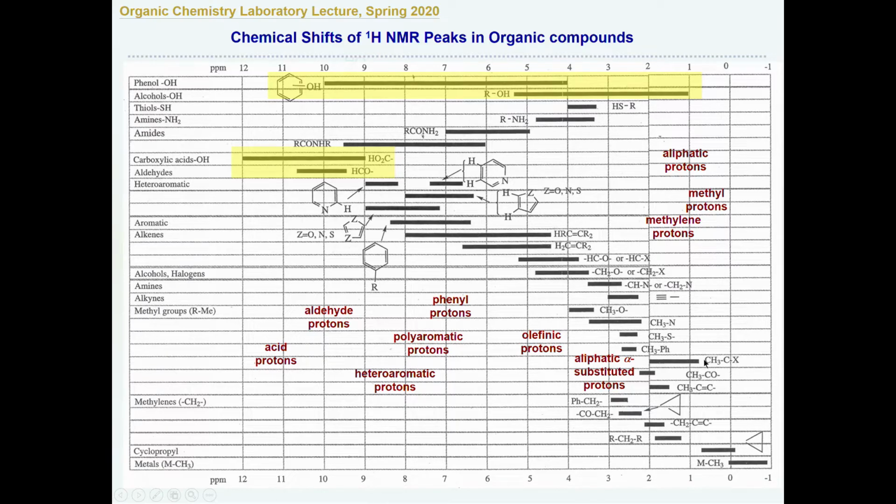Most of the time we use that as a baseline, and then once you change that covalent bonding to sulfur and nitrogen, which are more electronegative, of course it's going to shift this proton's chemical shift, because it lost electron density and also the local magnetic field changes, so it will shift in this way. And if you link to even more electronegative oxygen, you shift it even more. You see, it's correlated to the electronegativity of the linkage. Besides that, of course, a halogen or a carbonyl or some other electron-withdrawing group can shift them all around, right?